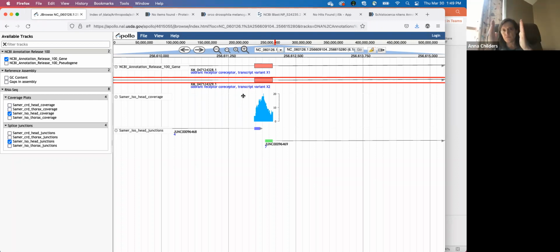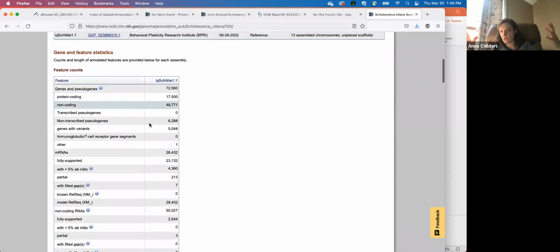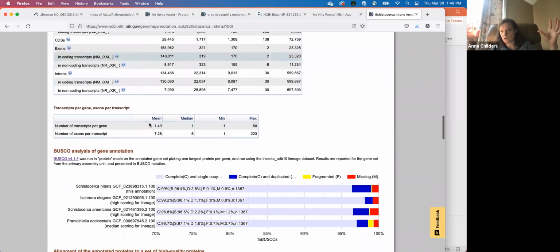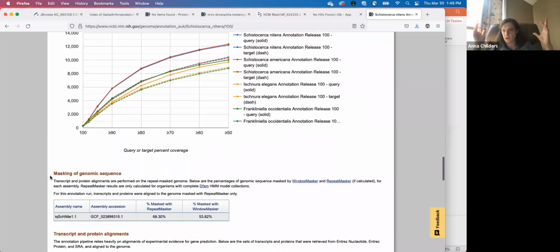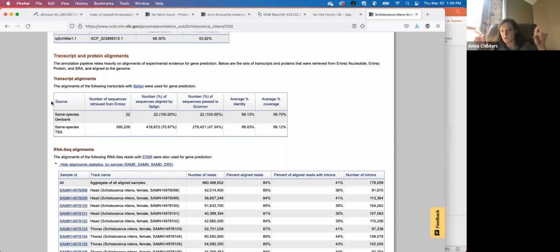Based on what we know a gene structure looks like, there is an entire prediction program that decides that we believe this is the structure of the gene, that there are 5 exons, that it's on the minus strand or plus strand, and that sort of thing. The boxes are the exons, like I said, and the introns are represented by a line in between them. Okay, sounds good. Thank you for clearing that up.